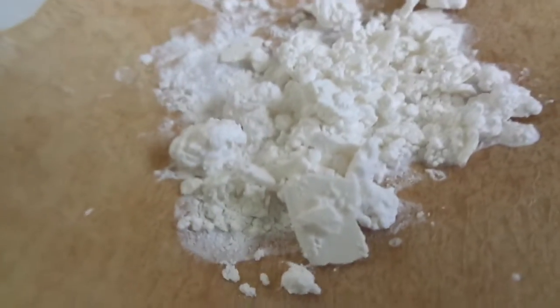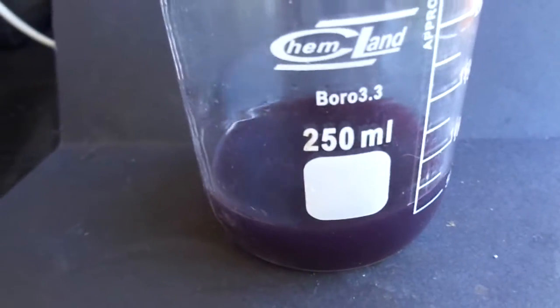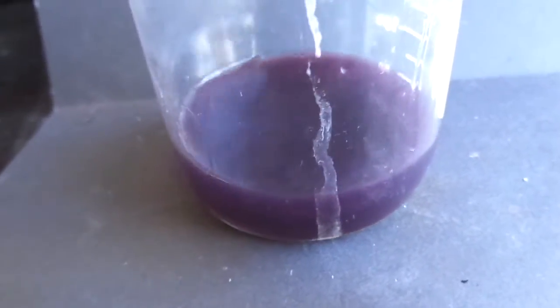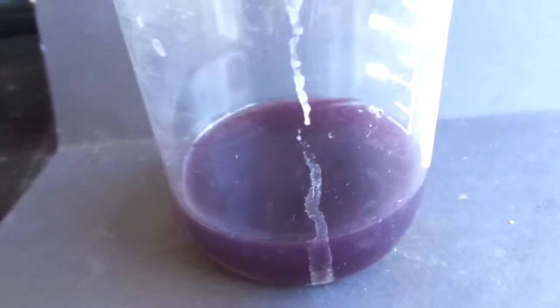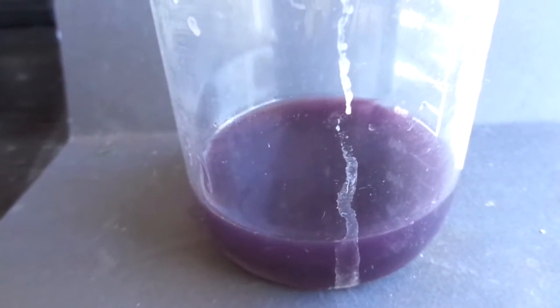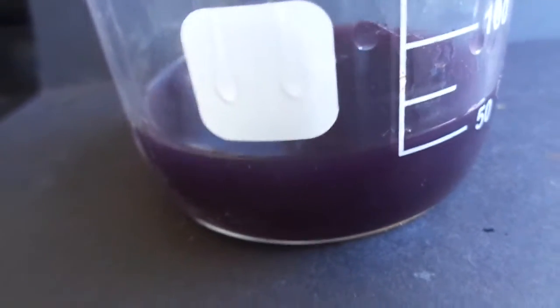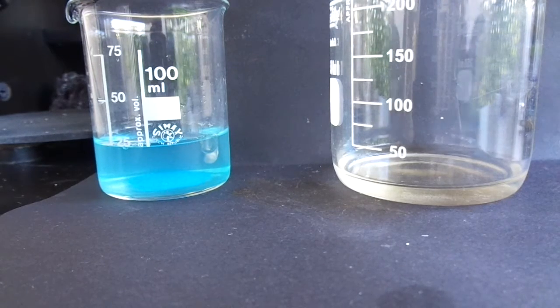I want to show you something interesting about biuret. I'm sorry I couldn't show you the reaction of biuret with copper sulfate live because I ran out, but I did it previously and as you can see it yields a nice purple solution. This reaction is normally used for detecting proteins — you basify a copper sulfate solution with sodium hydroxide, then add your protein, and if it turns this violet color, the test is positive. This reaction is actually named after biuret's reaction with copper sulfate.